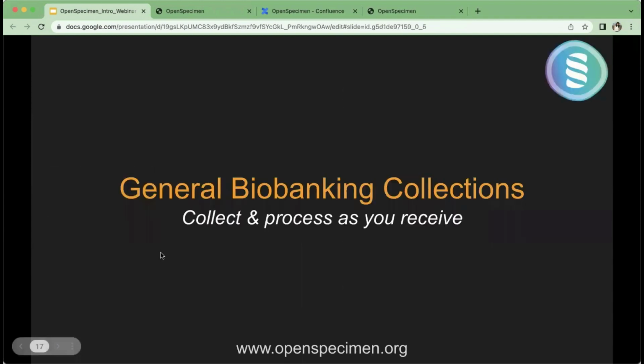But you might have other types of collections, where you don't have a predefined clinical study for which you're collecting samples. It might be general biobanking. So you only know that you're going to get these samples on a daily basis, might be from multiple sites. You can just collect and process as you receive. In these cases, you don't have to predefine the study definition. You can just have a general biobanking protocol and collect the samples as you go. So these are different types of collection.